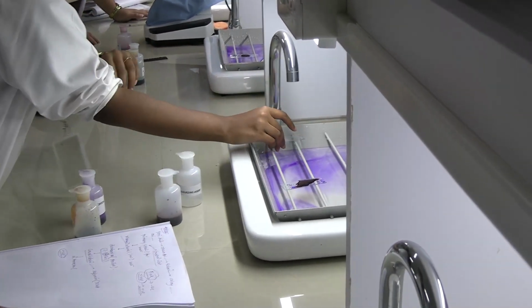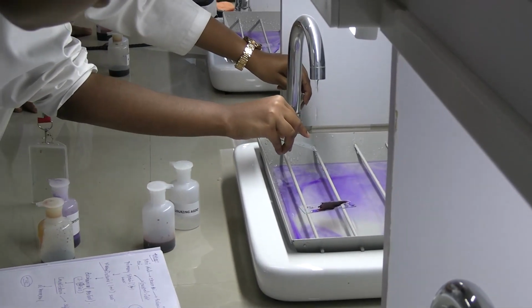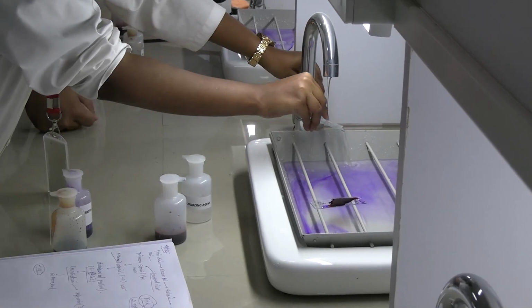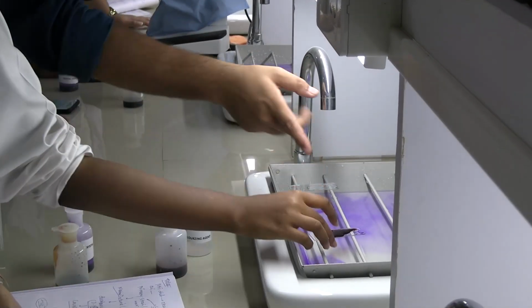Check your own times, okay? No, you are doing it again wrong. Your finger should be above the slide. Otherwise, how are you gonna wash the smear? Sir, 1 minute. Hold it a little bit. Okay, okay. Do it.